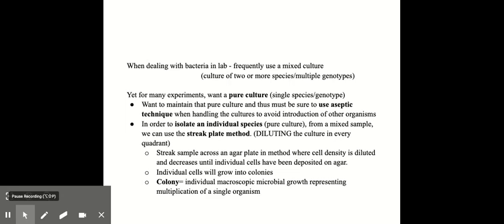When dealing with bacteria in the lab, we frequently use a mixed culture. That means a culture that may consist of two or more different species. But for many experiments, we want a pure culture or single species. So we want to maintain that pure culture and have to be sure to use aseptic technique when handling the cultures to avoid introduction of other organisms.